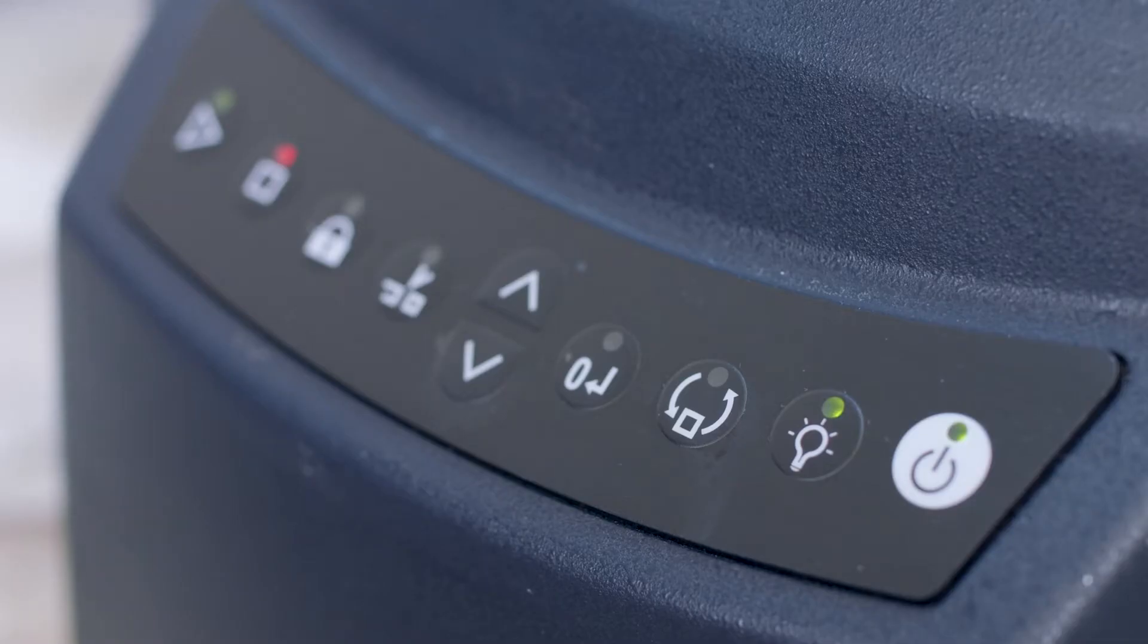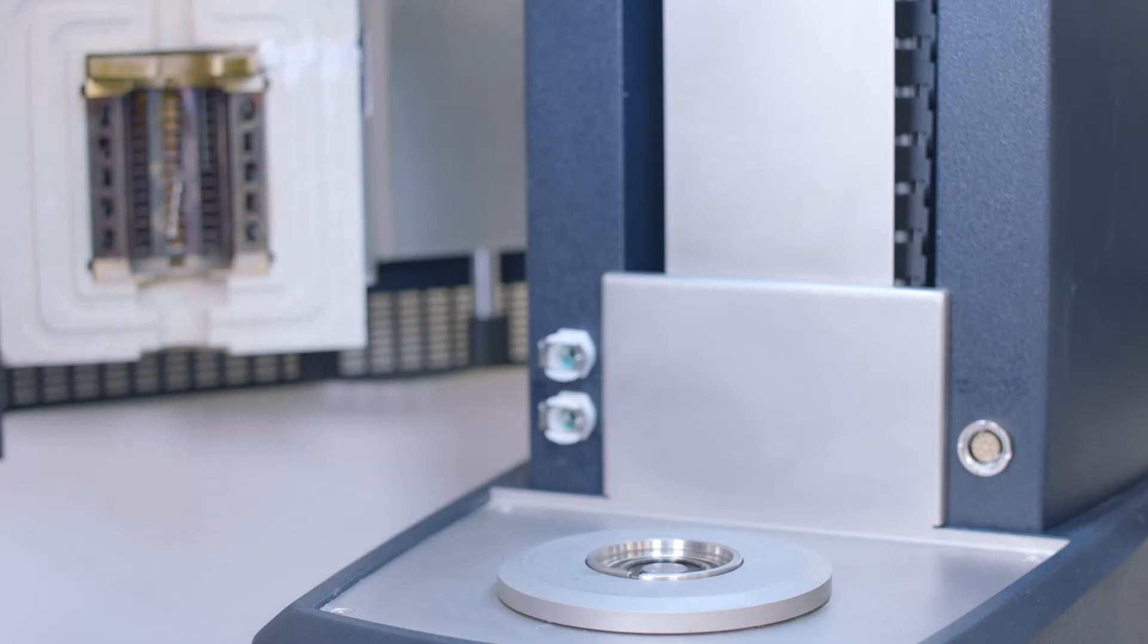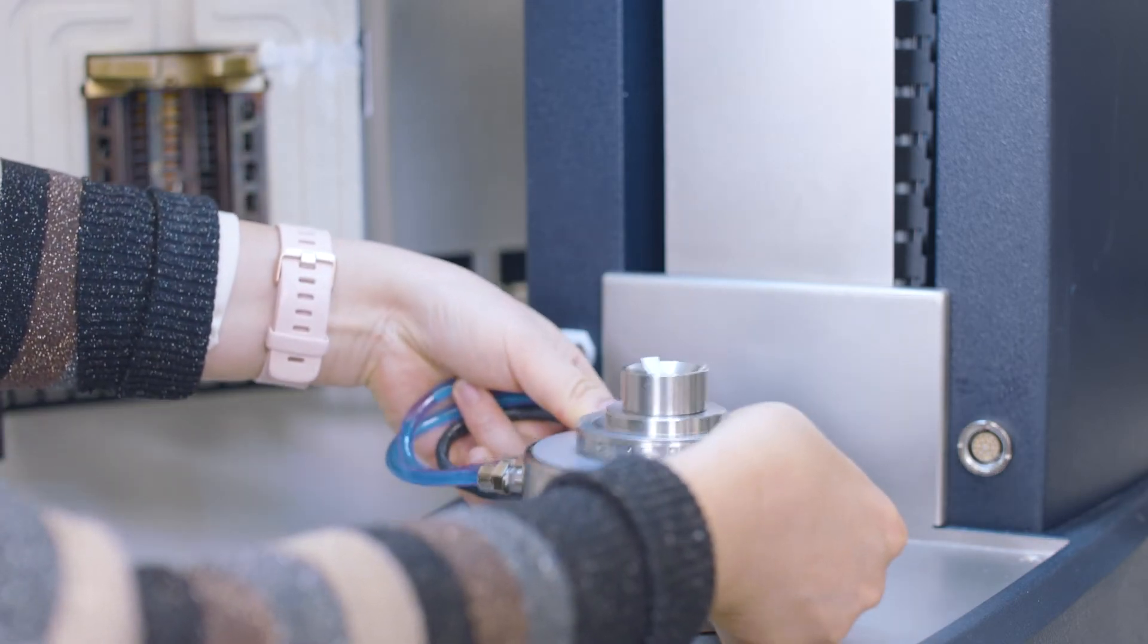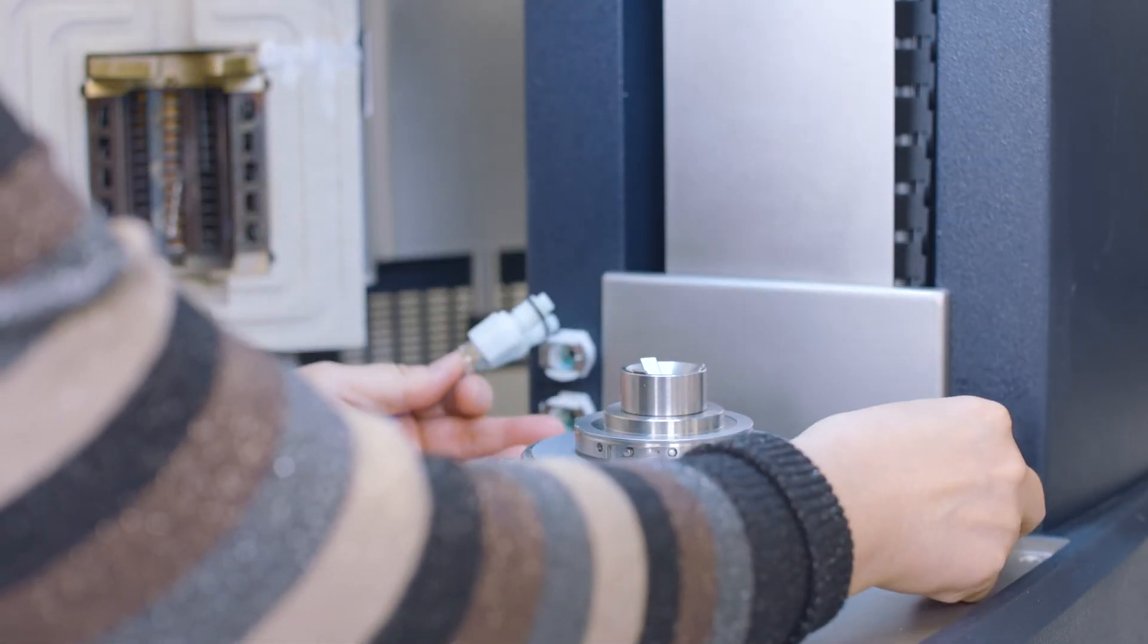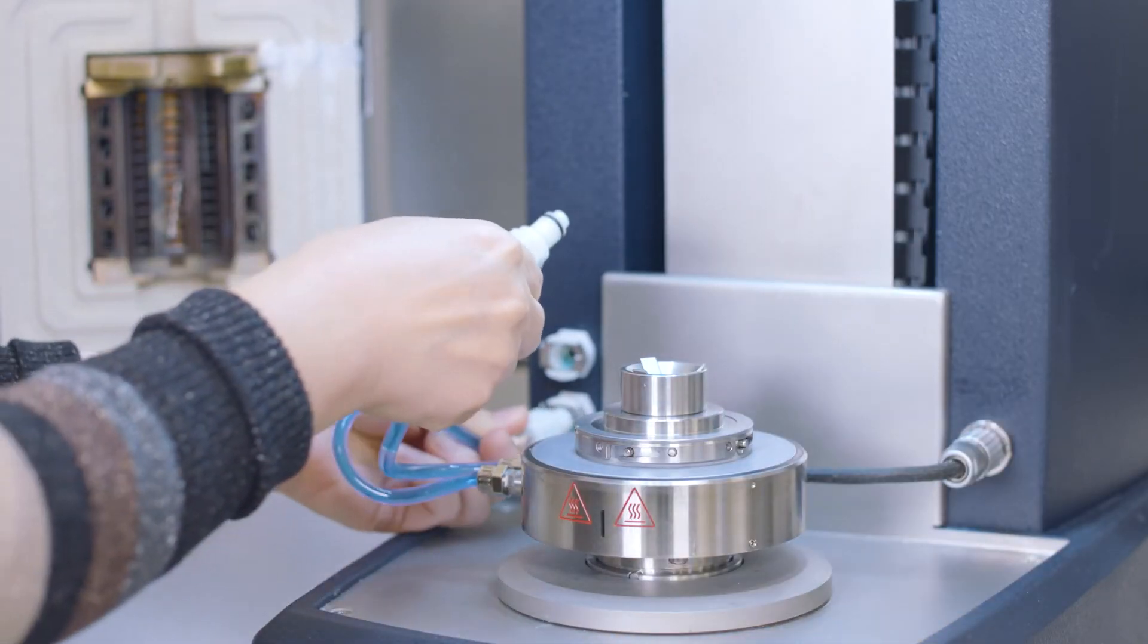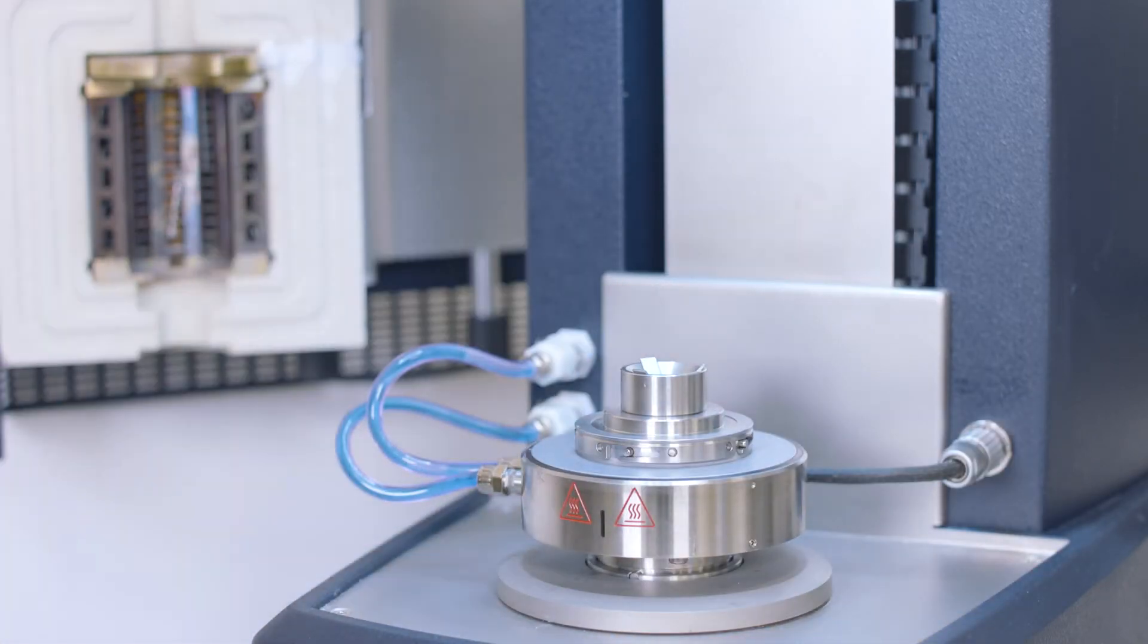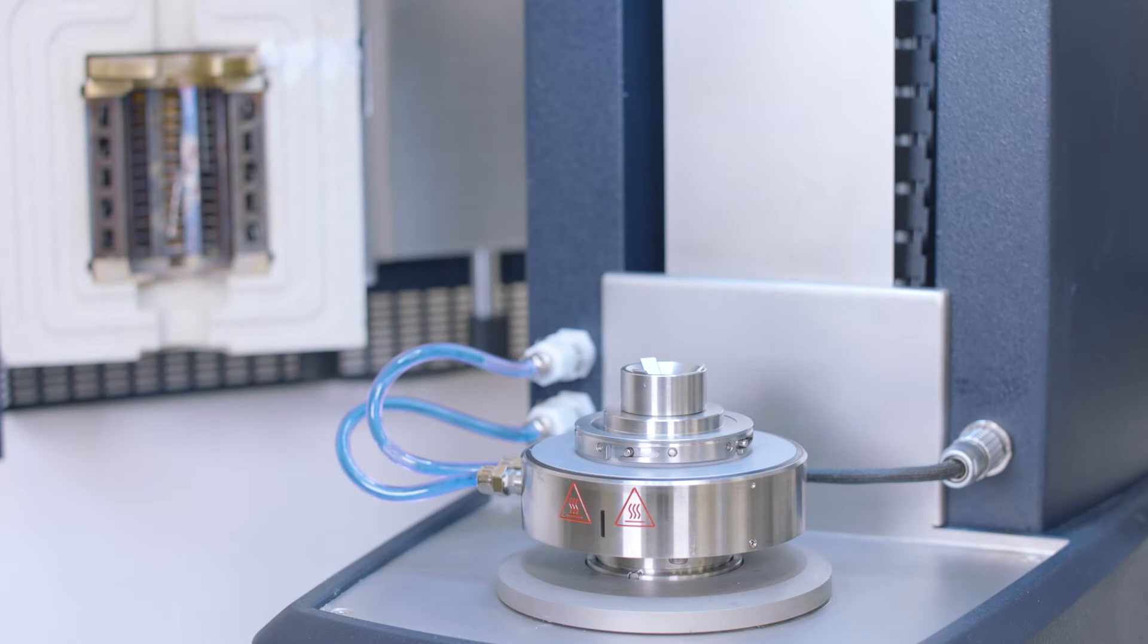From the instrument control panel, press this button to temporarily release the magnet. Put the Peltier onto the instrument bottom stage. Then, insert the Smart Swap plug with the red dot facing up. Plug in the circulating tubes and turn on the circulator.